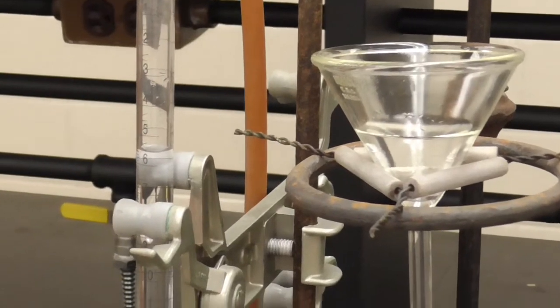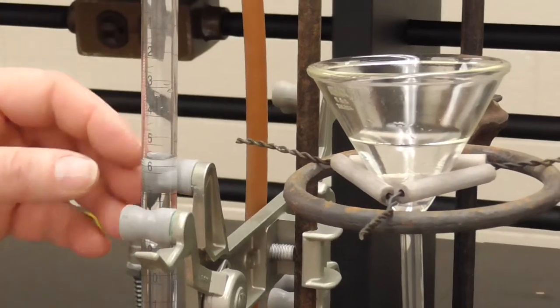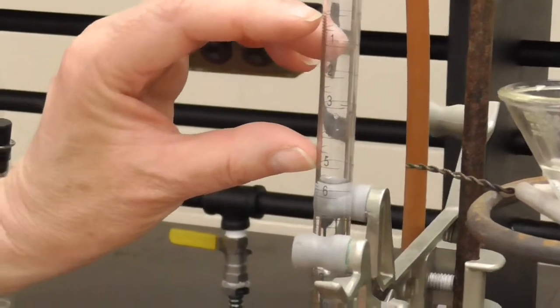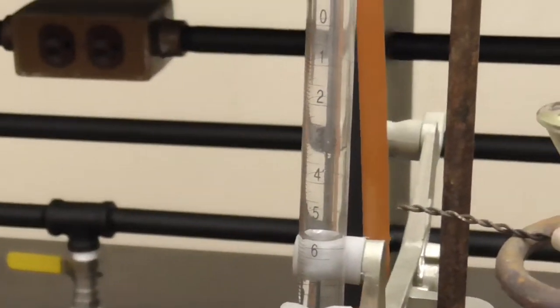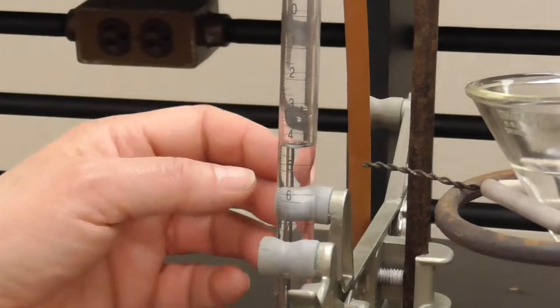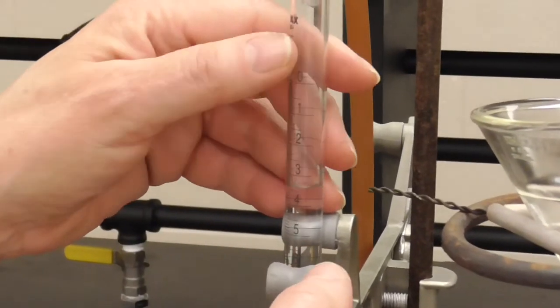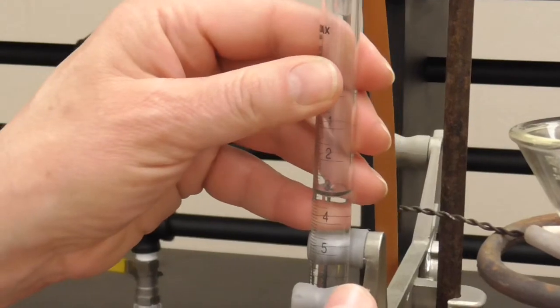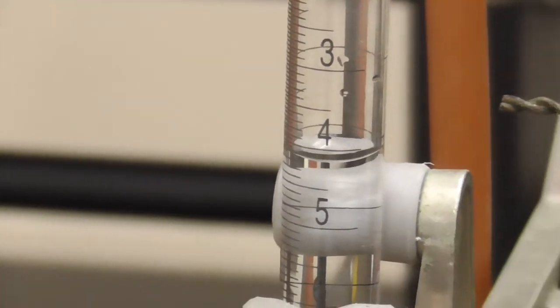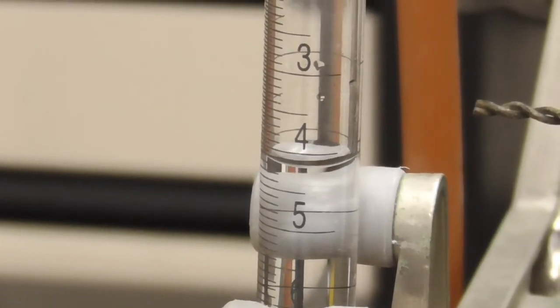Now, I'm going to do a couple of adjustments. Your lab manual suggests that we start with the level of the water between 0 and 5 milliliters, and it is not yet at that point. So I'm going to loosen this connection over here to allow air to go into the apparatus, and then I'm going to change this level, dropping the burette a little bit so that it now drops into that range between 0 and 5. Sorry, folks, I didn't focus correctly. Now I'm going to tighten that up again.